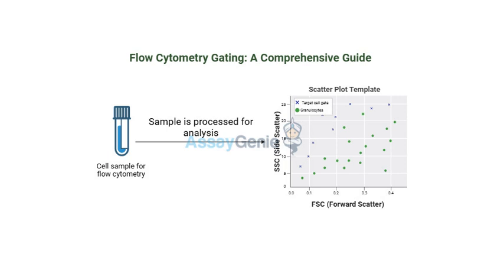If we're looking at T cells, for example, we'd use antibodies that bind to CD3, which is on all T cells. Right. And then we can analyze the fluorescence signal, and that tells us the percentage of CD3 positive cells in the sample. And if we want to look deeper into the T cells, we could use antibodies against CD4 and CD8 to tell the difference between helper T cells and cytotoxic T cells. Exactly. It's like using different badges to identify the different players in our cellular world.